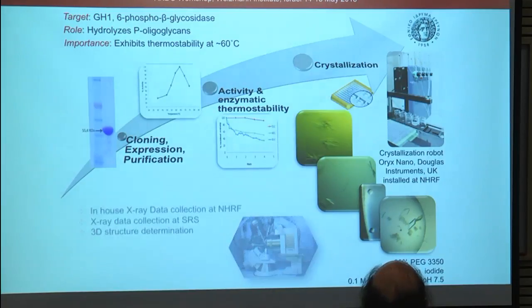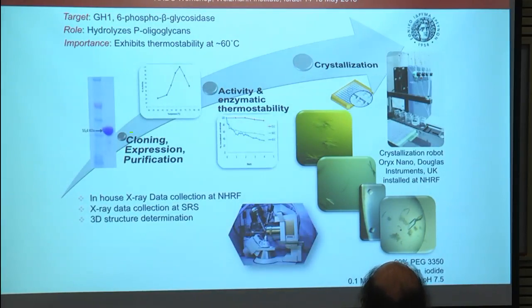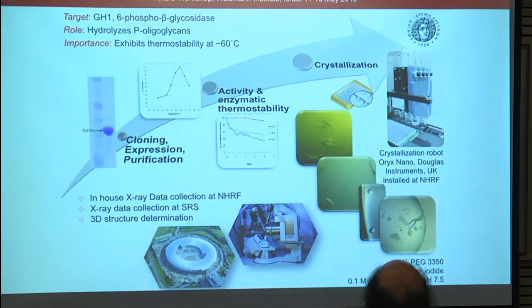All crystals are tested in our in-house X-ray robotic facility, and we confirmed that they are protein crystals, but the resolution was too low for preliminary characterization. So now we are working on improving the size of the crystals, and we aim to collect high-resolution data from synchrotron radiation sources in one of the European facilities, such as ESRF or another synchrotron.